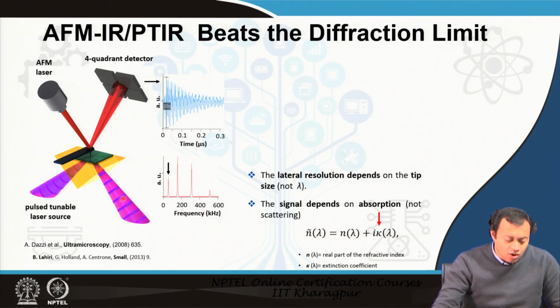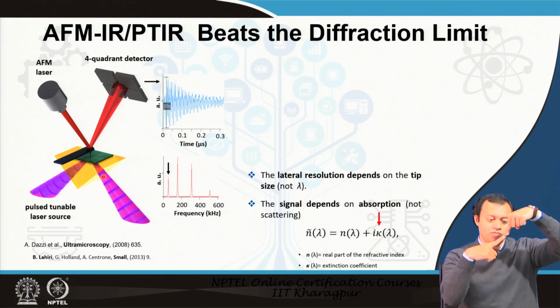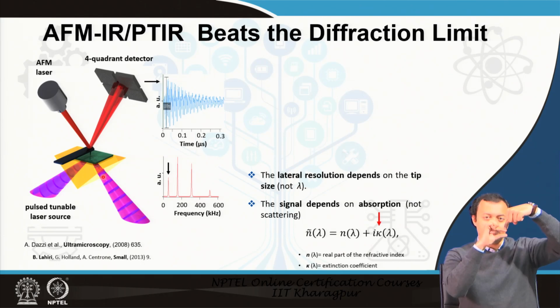If the wavelength of the pulse matches the absorption frequency of the sample, this is aligned. Wherever the cantilever tip is, the illuminated pulse laser is just there, with only the sample in between.